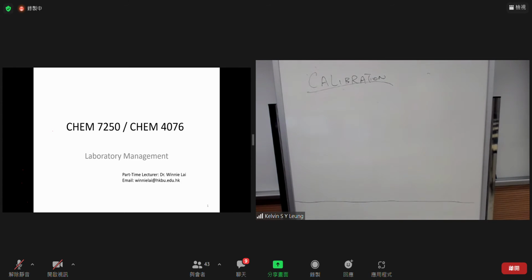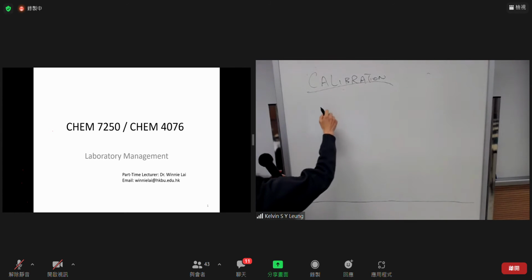Can anyone text in the text box for me? Last week, for the calibration, the number of standards that I would like to suggest you prepare is 7. And is there any specific requirement in preparing these 7 standards? Yes, we have to have an evenly distributed concentration.